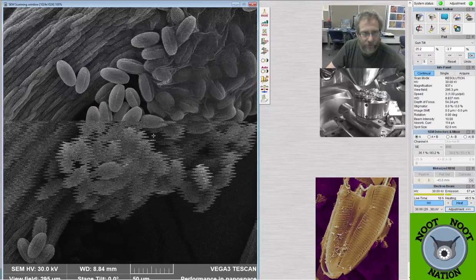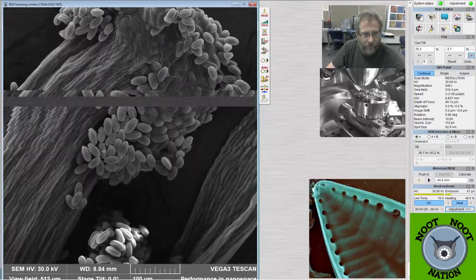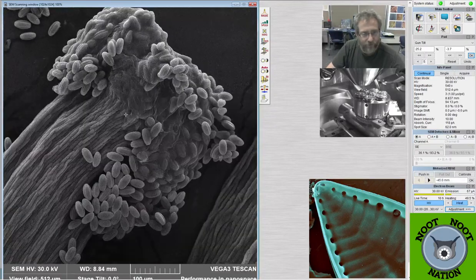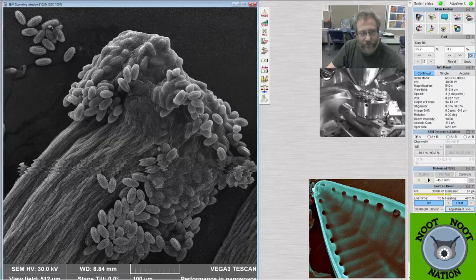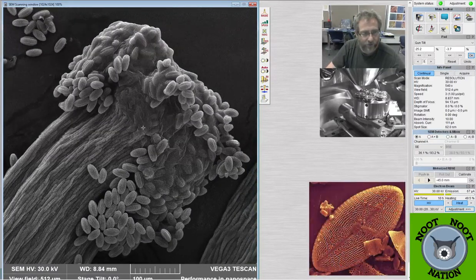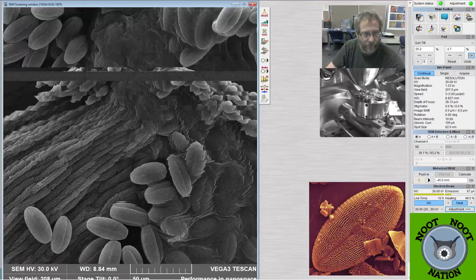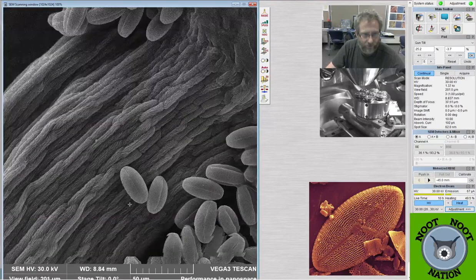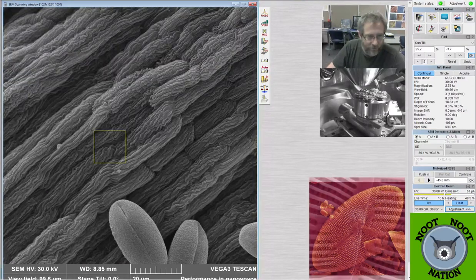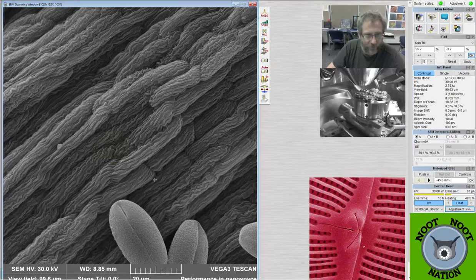And then I'm gonna get that really bright stuff off the screen. And I guess I'll take one more image here with these, because this is kind of interesting looking stuff over here. The plant cells themselves look kind of crazy, don't they? Especially with this level of detail.